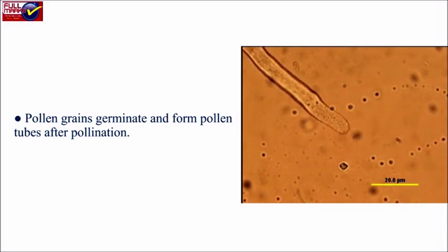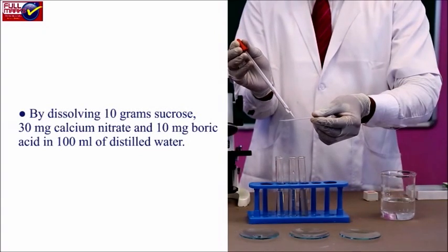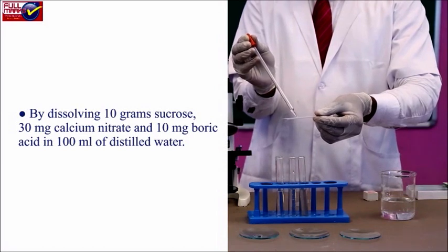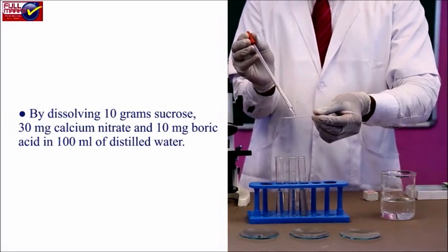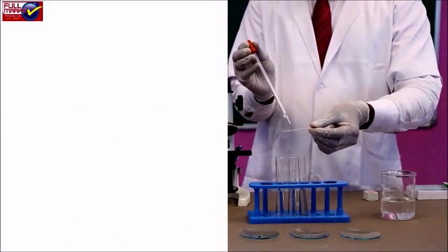Prepare the pollen germination medium by dissolving 10 grams sucrose, 30 mg calcium nitrate, and 10 mg boric acid in 100 ml of distilled water. Using a glass rod, stir the solution to mix it well.